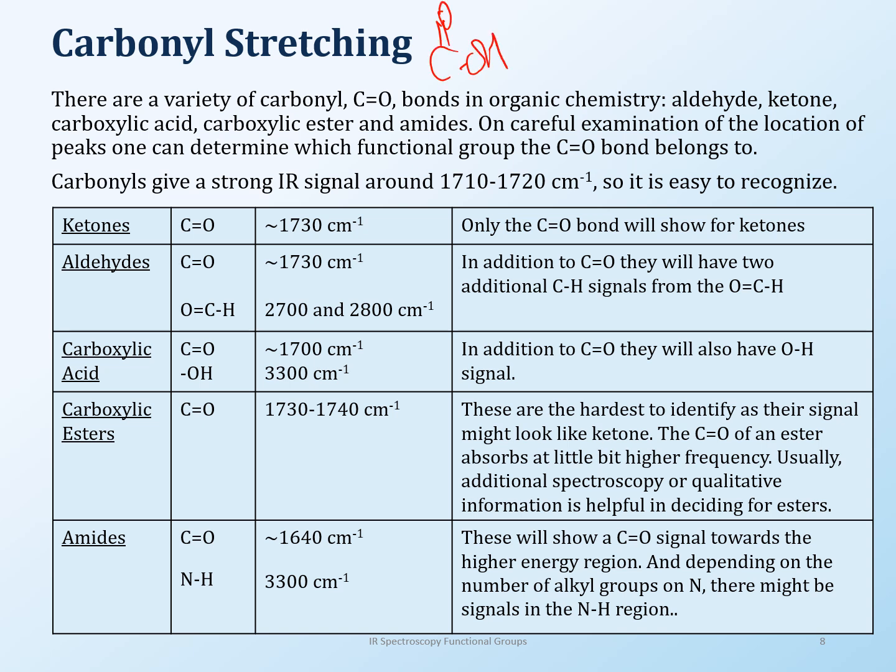We never say that you should look at this as a ketone and this as an alcohol. No, we don't see that. But when the IR is looking at it, it is looking at it as a carbonyl and an OH. That's what it's looking at. So you have to be able to figure out whether this is what you have, a ketone and an alcohol, or a carboxylic acid. That's something you need to be able to figure out.